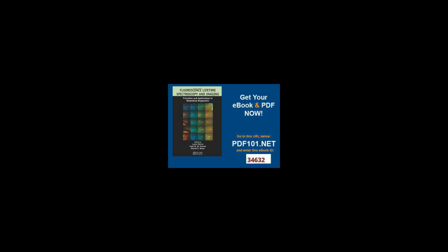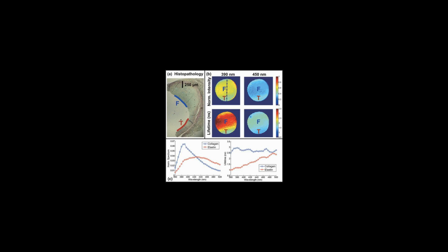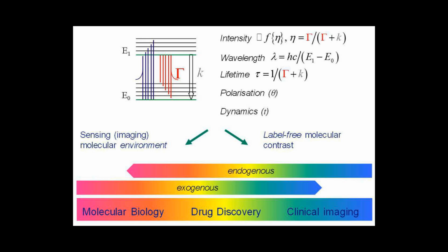Pulsed illumination. Fluorescence lifetimes can be determined in the time domain by using a pulse source. When a population of fluorophores is excited by an ultra-short delta pulse of light, the time-resolved fluorescence will decay exponentially as described above. However, if the excitation pulse or detection response is wide, the measured fluorescence, d(t), will not be purely exponential.